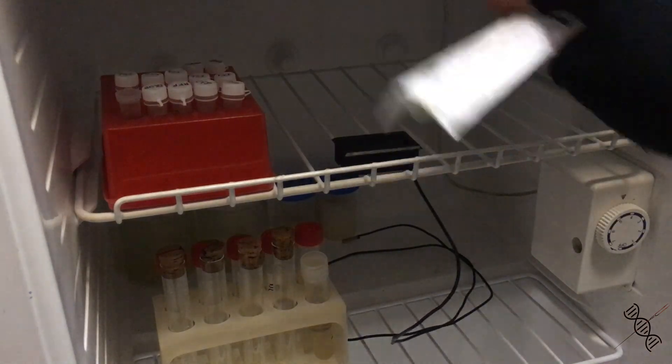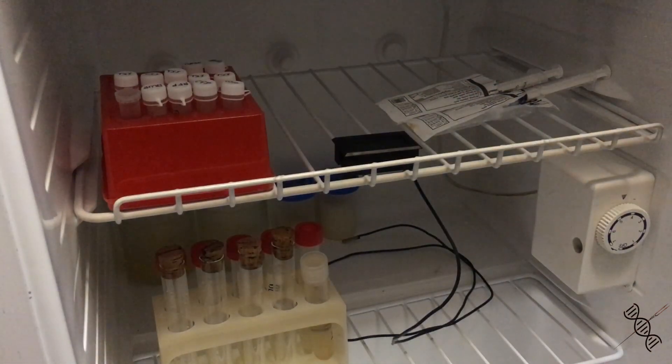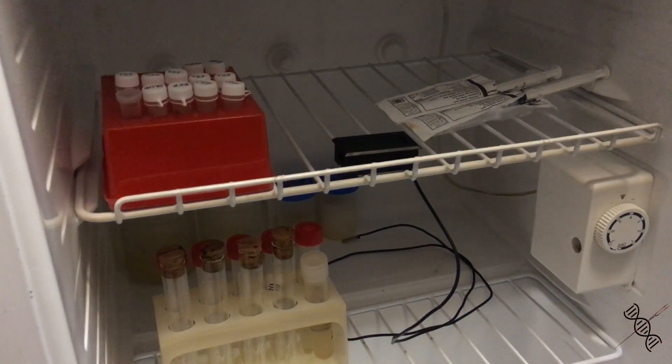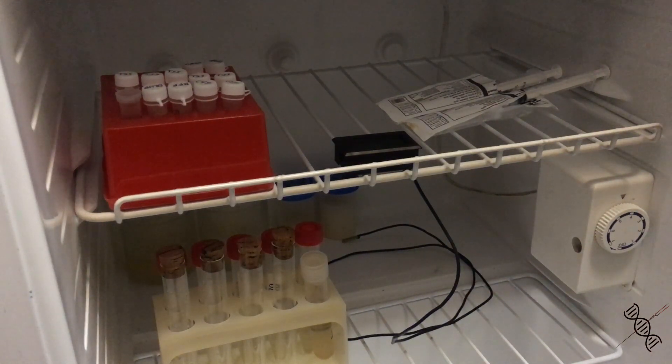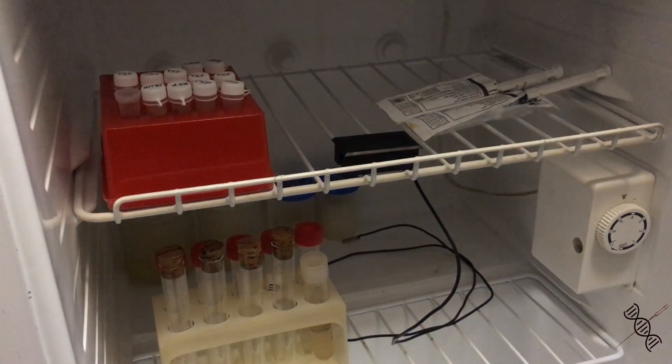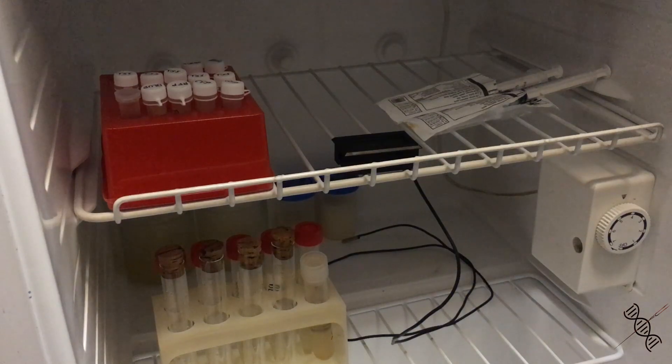Here are my antibiotic solutions, and also IPTG, lactose, and antibiotics — especially this one, I have ampicillin here. It's for selection of bacterial cultures and bacterial material. If you do a transformation — a plasmid transformation of E. coli or any other bacteria — you will need to use some antibiotic solution in order to make selection. Bacteria that got modified will acquire antibiotic resistance towards the antibiotic, so by adding some ampicillin in this case into the media, you will be able to only grow bacteria or other microbes which will be modified, and not the ones that did not get the antibiotic resistance genes.